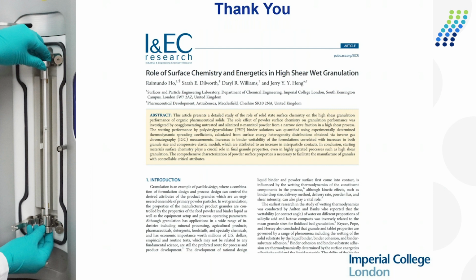I have another question about how effective IGC is as compared to AFM for measuring CAB for microparticles. Not sure what you mean by CAB. But certainly, in my experience, AFM measurements on single particles are pretty challenging, not very easy. It's a question really of how many hundred particles you want to do and how much PhD student time you want to use. So I think, although it's possible, it's quite challenging in my view, and I'm not sure it would be recommended.